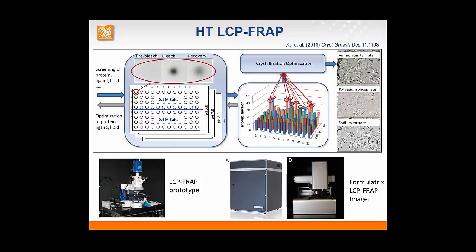What we found is that in many conditions the protein didn't diffuse at all. What you see here is the background of about 10–15% that is diffusion of labeled lipids that co-purified with the protein. There were only about a dozen conditions that showed appreciable diffusion of the receptor.